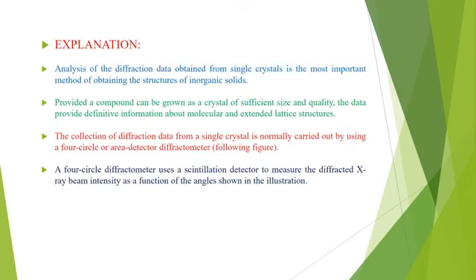In explanation, the analysis of diffraction data obtained from a single crystal is the most important method of obtaining the structure of inorganic solids. As we know, inorganic solids are solids found in the crystalline state, so these inorganic solids and their crystals are studied using the single crystal X-ray diffraction technique.